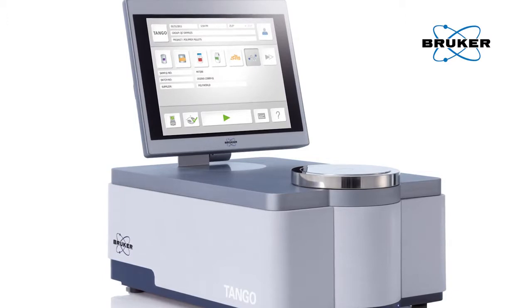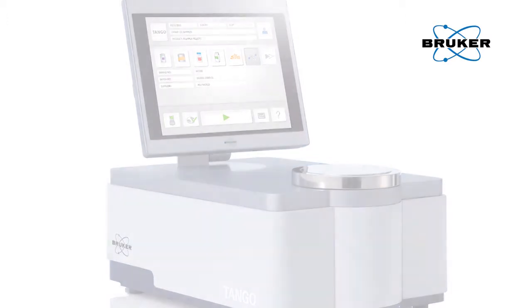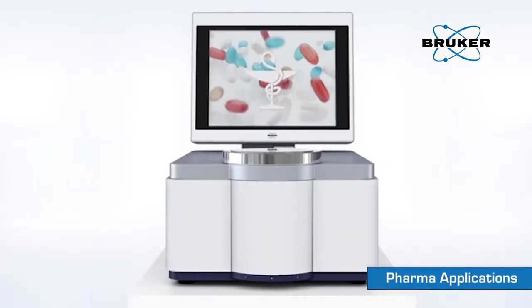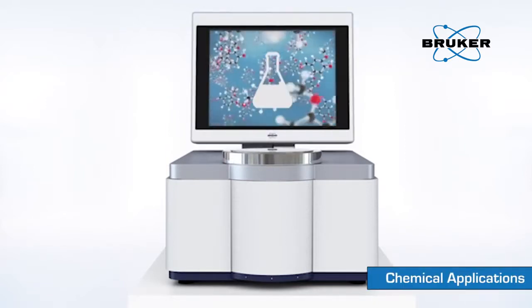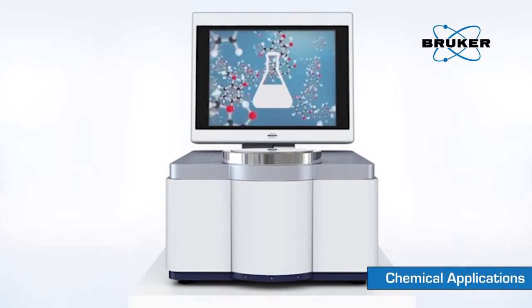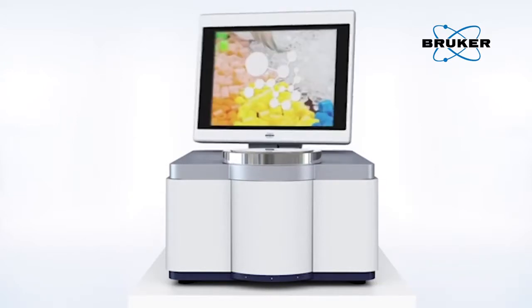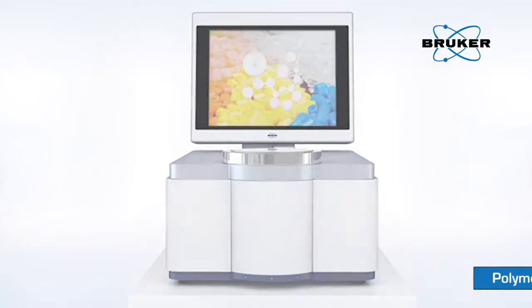Tango offers an efficient and cost-effective analysis for material identification and quantification in a wide variety of application fields. The comprehensive application support of the Bruker Specialists helps to select the optimal measuring method, as well as appropriate accessories and software solutions.